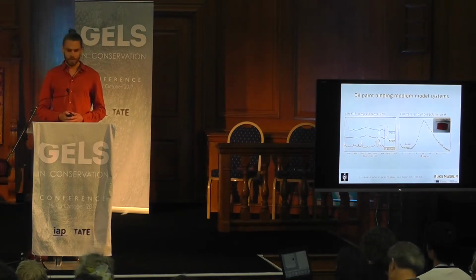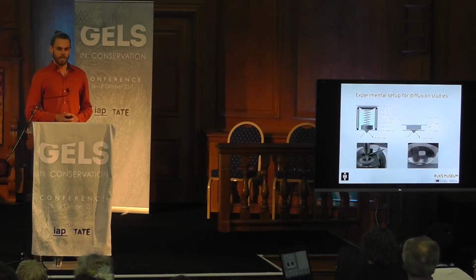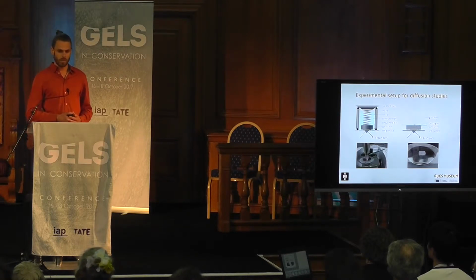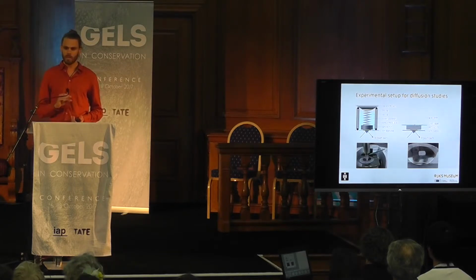So for this solvent release test, we developed a cell, and it's schematically depicted here. On the left, we see the design schematically. It's basically a solvent reservoir where you can load it with a solution with a solvent, and from the top, the solvent penetrates through a porous metal disc that with a light pressure pressurizes your model system onto the infrared detector.